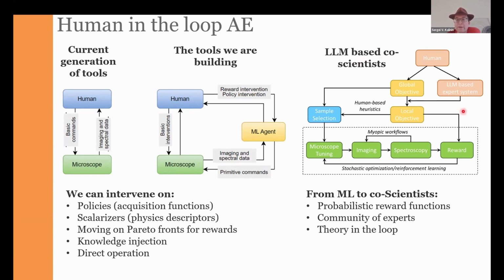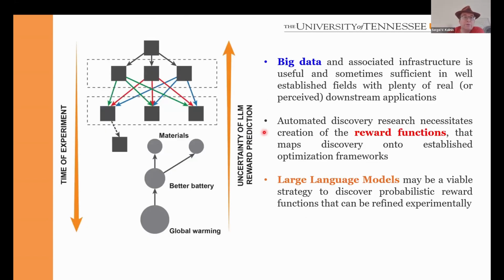And another very interesting thing is that once we start to run the ML agents in terms of the reward function, we basically build the bridge to the whole community that works on large language models, reasoning systems, and so on and so forth, because it is possible to convince essentially ChatGPT to formulate a plausible reward function and actually run the Python code that implements it. So in some sense, we build one of the possible bridges between the actual physical tools and the LLM-based reasoning models.